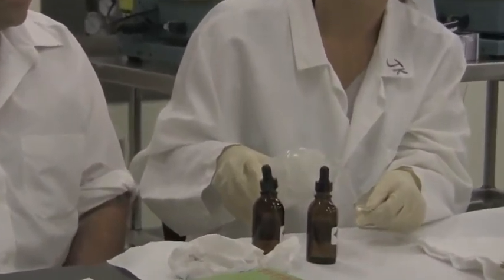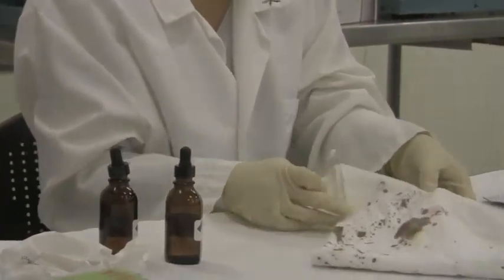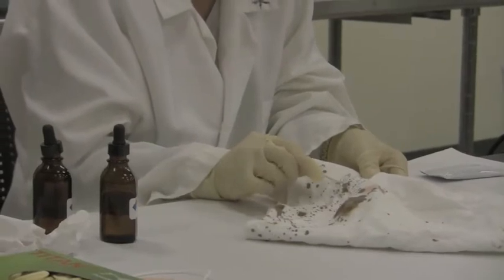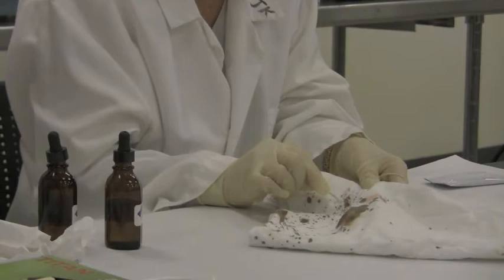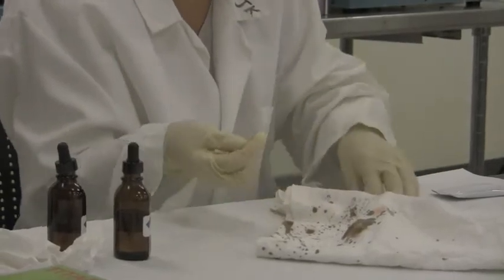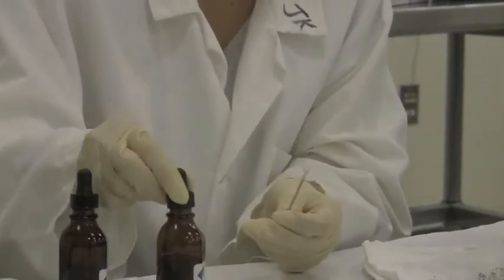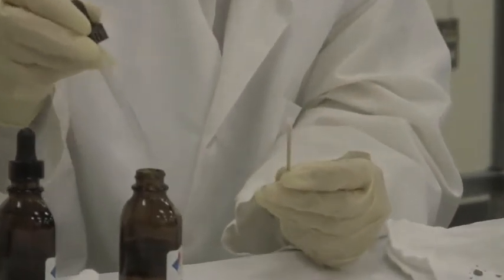Now let's actually test our piece of evidence. First, because it is a dry sample, I am going to moisten our swab with distilled water and rub it against the part I would like to test. I am just going to gently rub an area to see whether or not the stain is blood. I have a brownish transfer stain onto this swab. Next I'll add the phenolphthalein — the color reagent — two drops. We should not see a color change until we add the hydrogen peroxide. If it is blood, we should see a bright pink color.